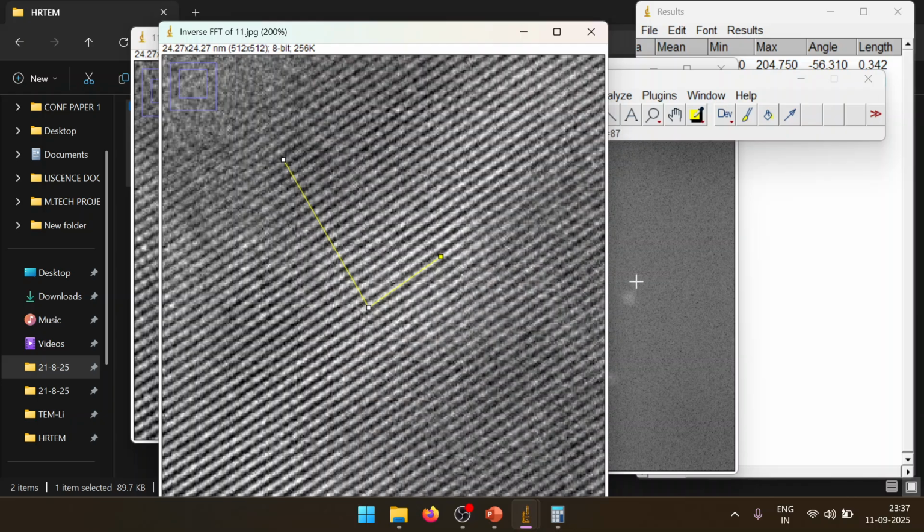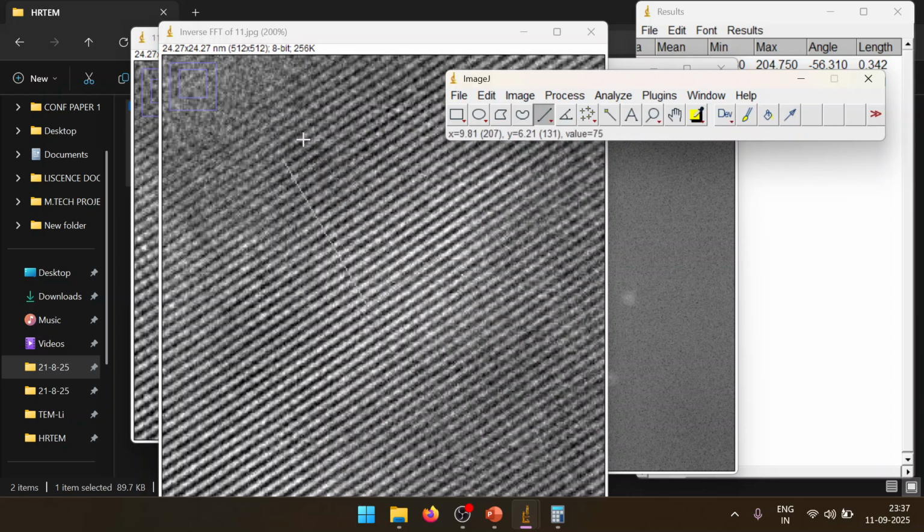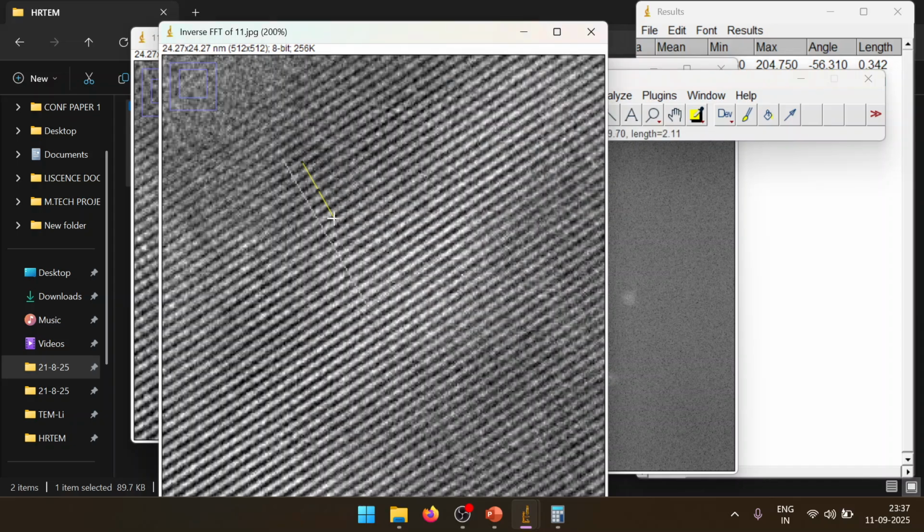Once you are done, press Control T so that your lines are drawn. Now you have two sets of lines. These are your guidelines, they don't measure anything; this is just for you to draw a parallel line. So I take from here to here, and now I know that my line has to be parallel to the line drawn. This is the purpose of these drawn lines.